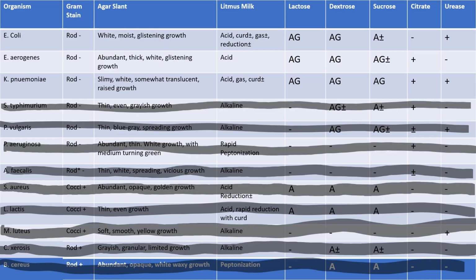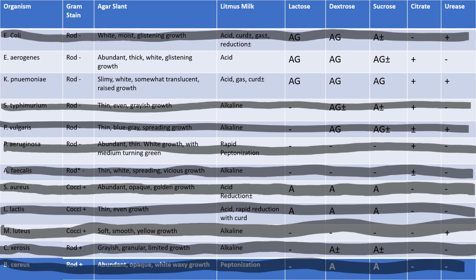This test eliminated the possibility of the specimen being E. coli. This led me to believe that my specimen is E. aerogenes or Klebsiella pneumoniae.